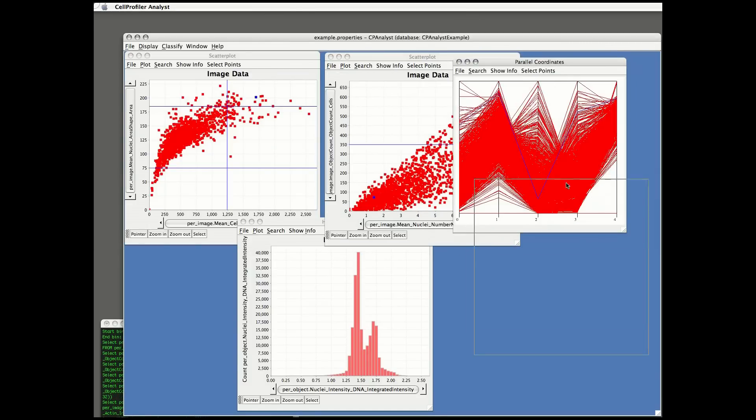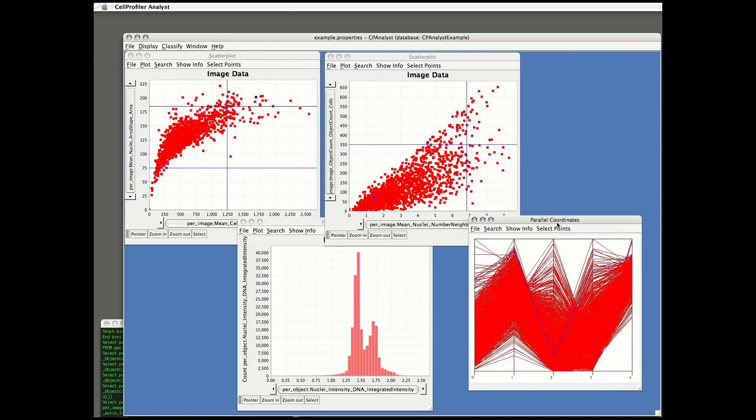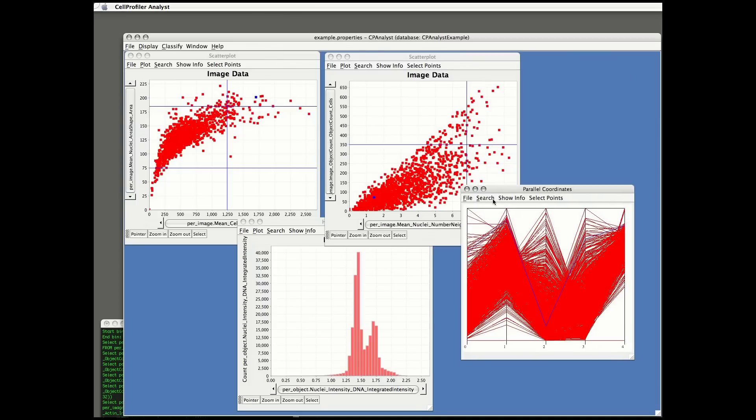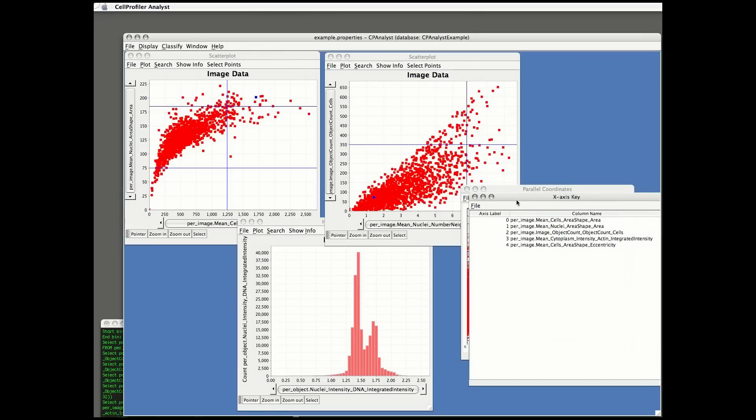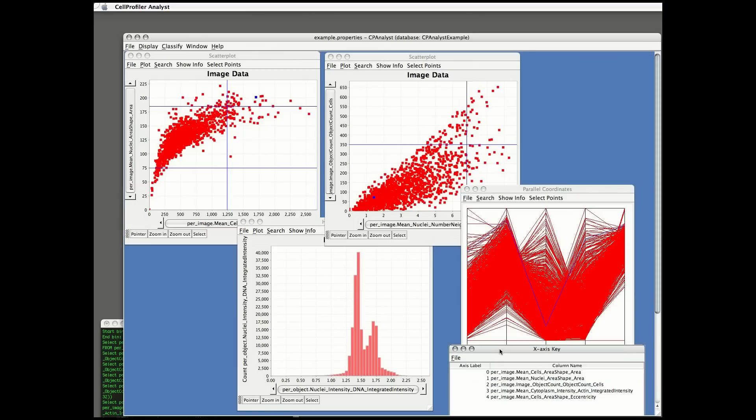In the parallel coordinates plot, I'm going to show the identity of the axes by choosing Show Info and Show Axes. You can see the five y-axes that are shown in the plot.